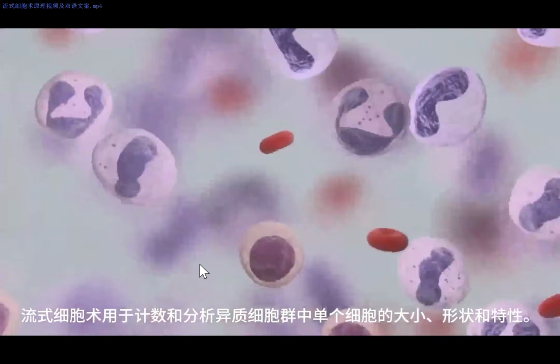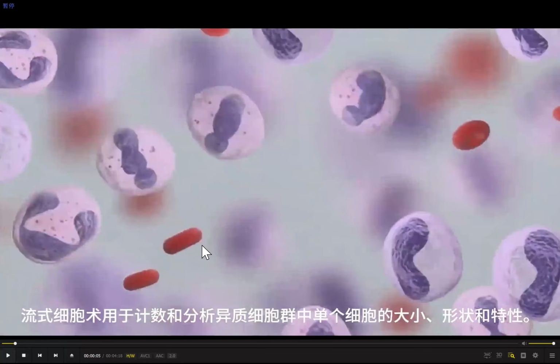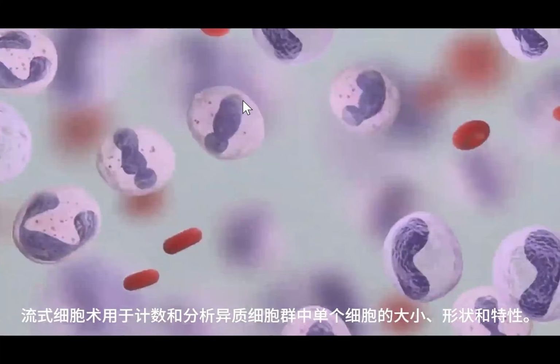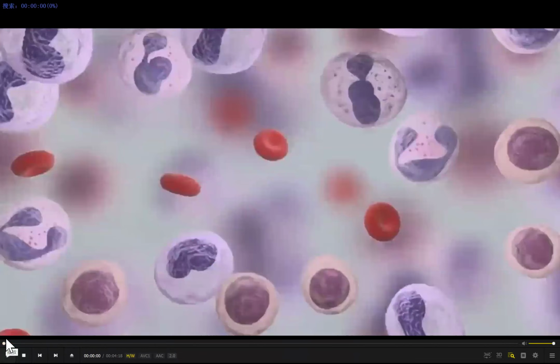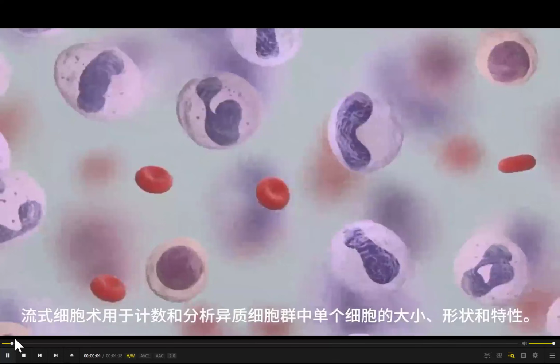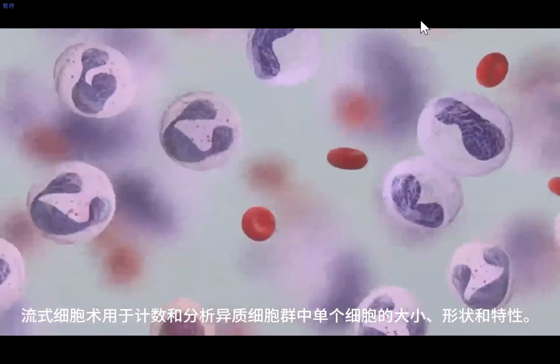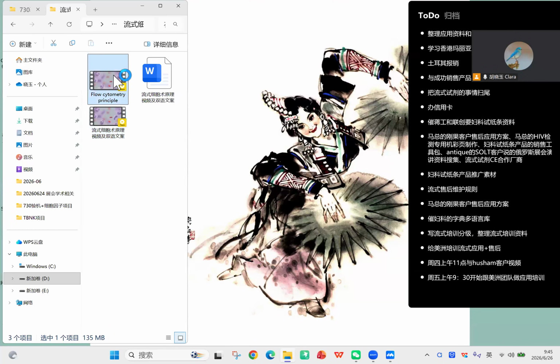Yes. Okay, so flow cytometry is used to count and analyze the size, shape, and properties of individuals. Can you hear the voice of the video? Yes, we can hear. Okay. Flow cytometry is used to count and analyze the... Sorry, I have another version that has the English subtitle here.